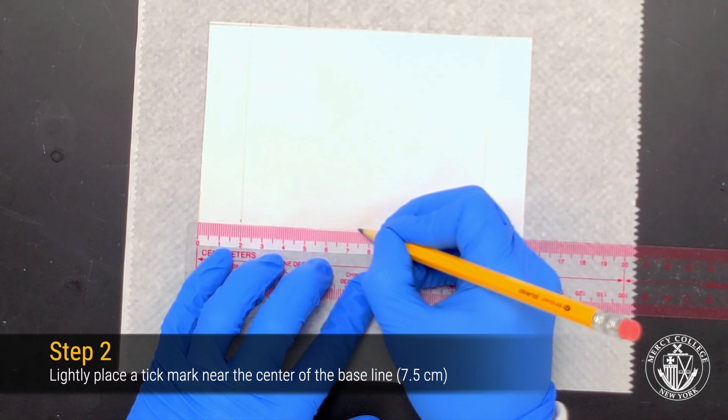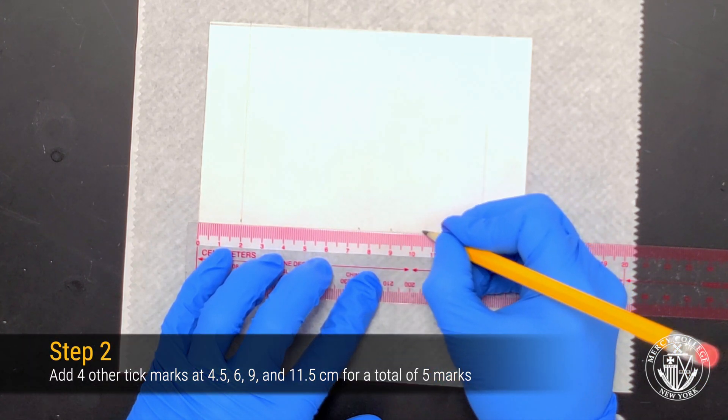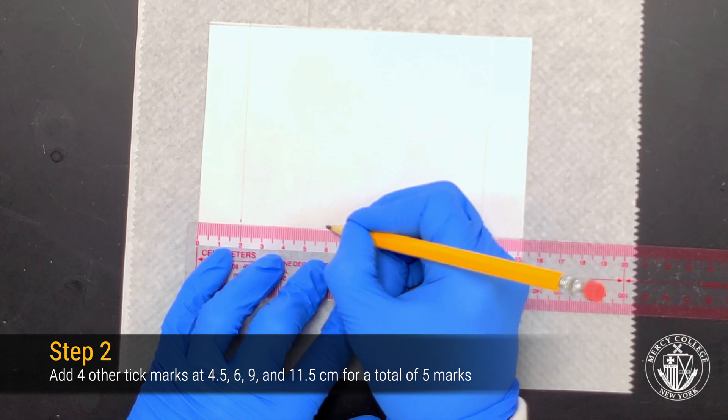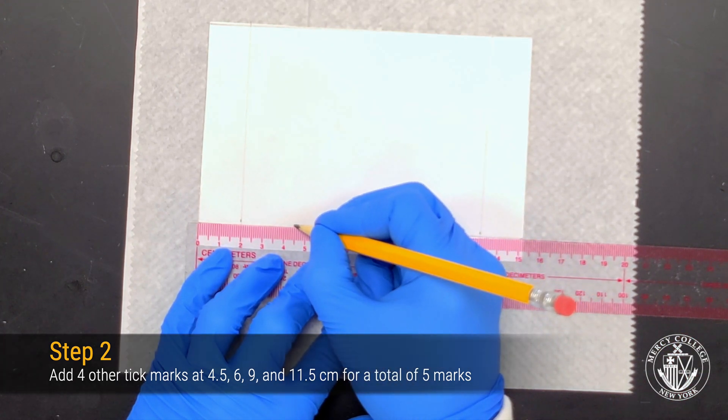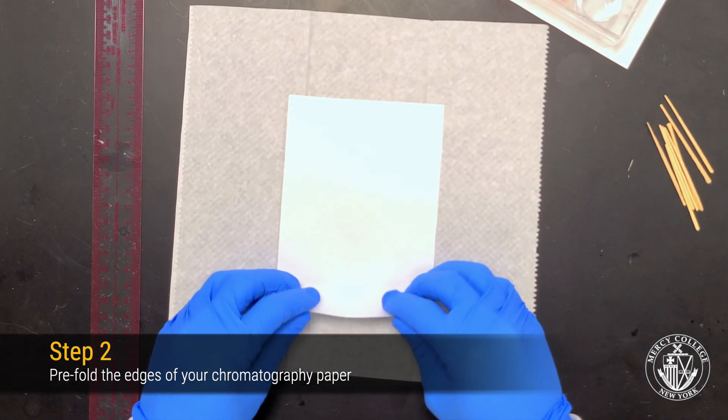To complete your baseline, draw five equally spaced tick marks starting from the center and working out in increments of 1.5 centimeters. These will be the positions where you will eventually apply the dyes. Next, go ahead and pre-fold the edges of your chromatography paper.